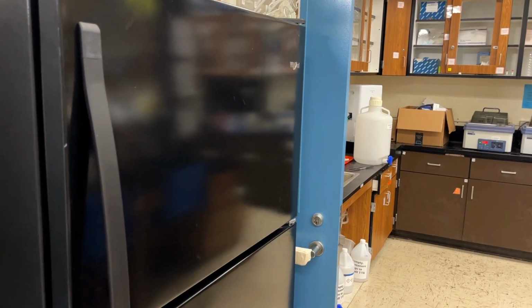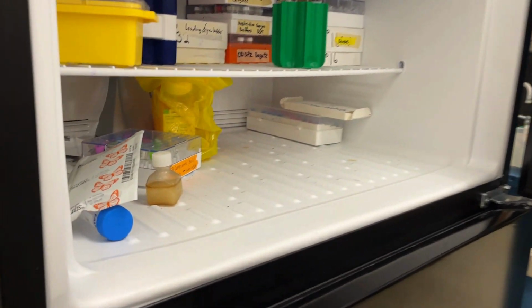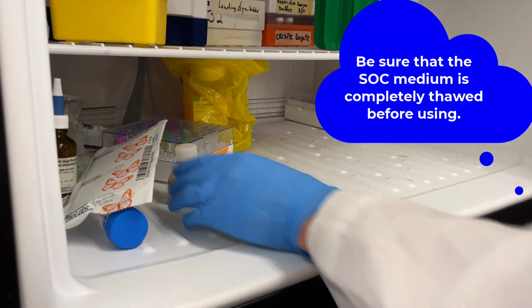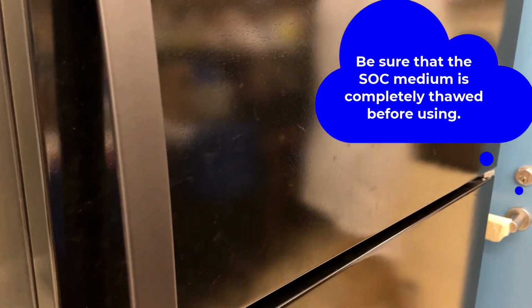The other thing you want to get ready is the SOC medium. This is typically in the freezer. It is frozen, so it will take a little while to thaw. So once again, just pull it out and let that sit on the bench.